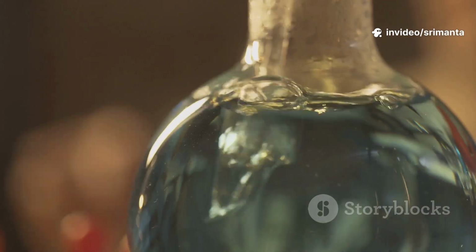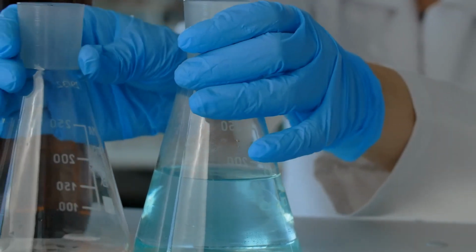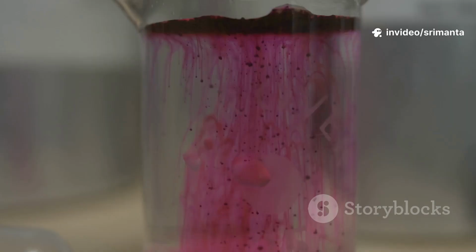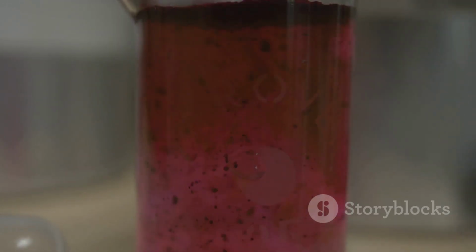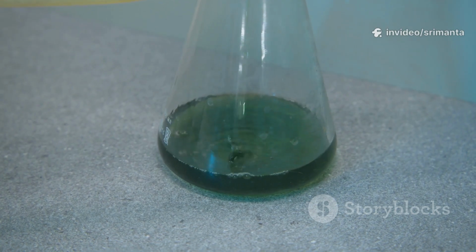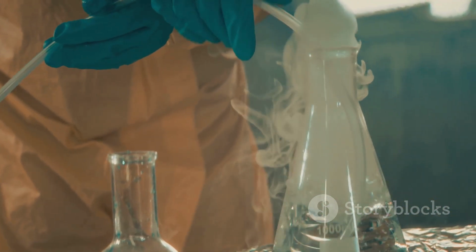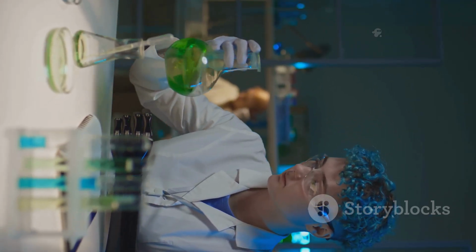Now for the main event, making the gas. Once the arsenic is in the form of arsenious acid, we add a reducing agent. A reducing agent is a substance that donates electrons in a chemical reaction. In the Gutzeit test, we often use zinc metal. When we add zinc to the acidic solution, it reacts vigorously to produce hydrogen gas. This is a very powerful reaction. This newly born or nascent hydrogen is super reactive. It immediately seeks out the arsenious acid and reacts with it. This reaction reduces the arsenious acid, turning it into arsine gas. So the solid or dissolved arsenic is now floating around as a gas, mixed in with all that hydrogen.